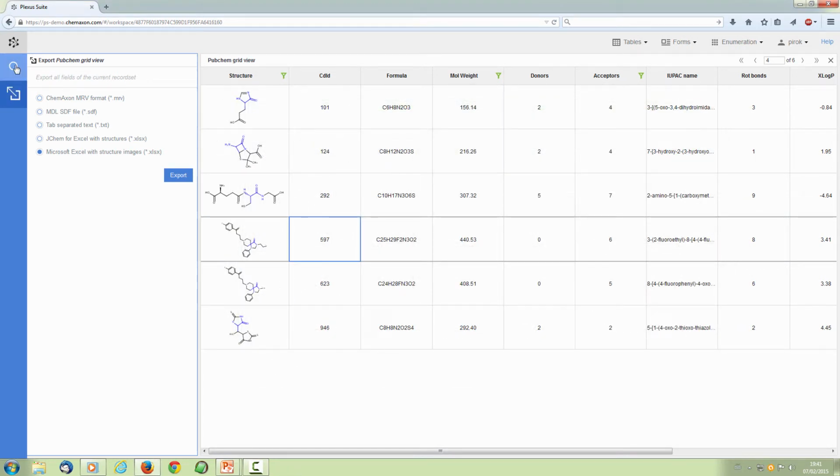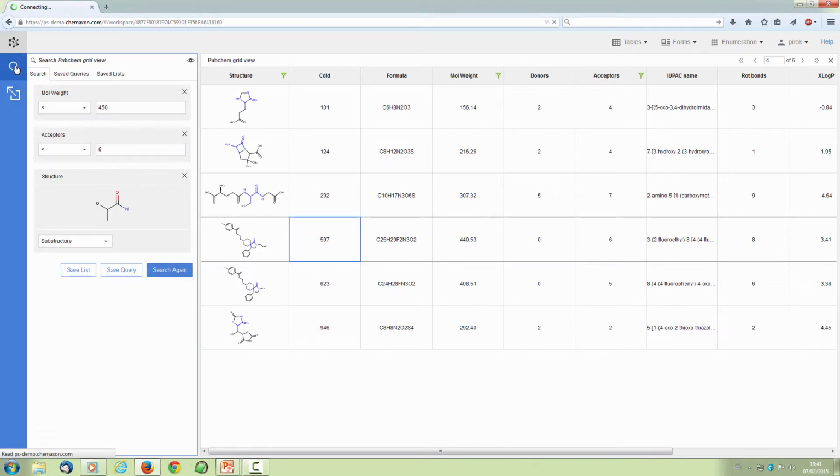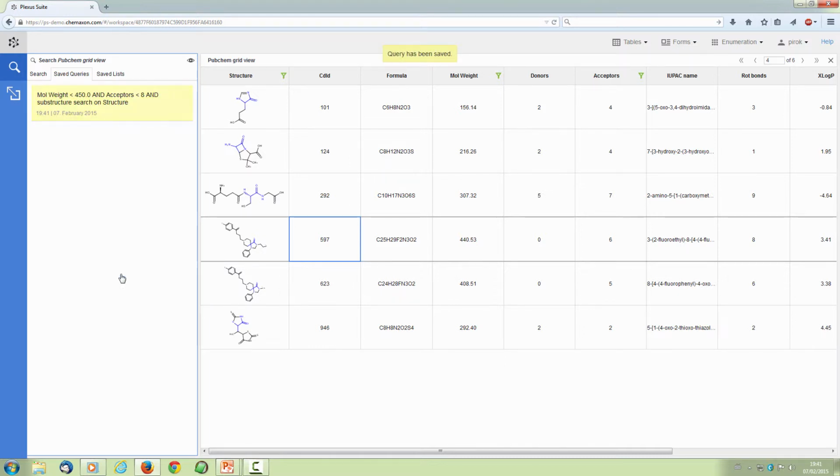Okay, let's return to my search. I still have this search. I like it, so I may want to reuse it in the future. So I save this query to make it permanent. I can reuse it. I can give a name to it. So my favorite query. Okay, I have it. I can rerun it anytime.